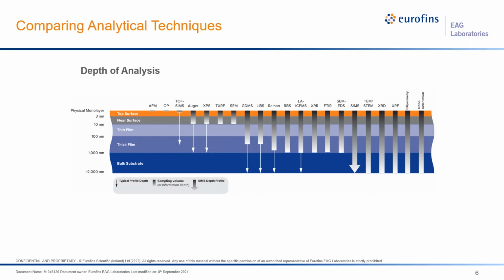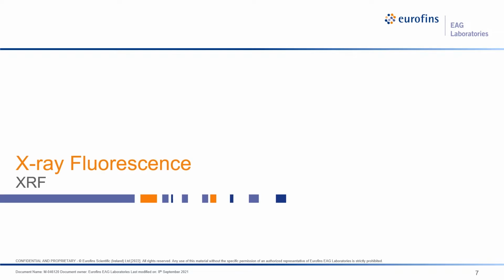It just means we need to tailor our choice of tools to fit what we're trying to measure. And often these techniques with their different sets of data will help paint a more complete picture of the material we're analyzing. So let's get started with today's topic, X-ray fluorescence.